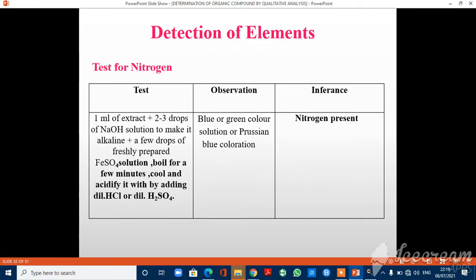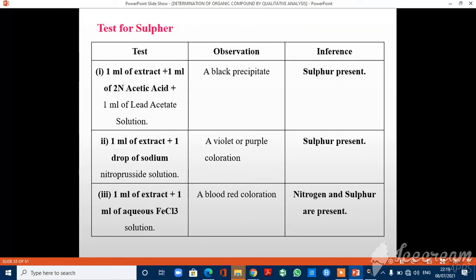Test for Nitrogen: Take 1 ml of extract plus 2-3 drops of NaOH solution to make it alkaline. Add a few drops of freshly prepared FeSO4 solution, boil for a few minutes, cool, and acidify with dilute HCl or dilute H2SO4. If a blue or green color solution or Prussian blue coloration is observed, nitrogen is present in the compound. Test for Sulphur: Take 1 ml of extract, 1 ml of normal acetic acid, plus 1 ml of lead acetate solution. If a black precipitate is observed, sulphur is present.